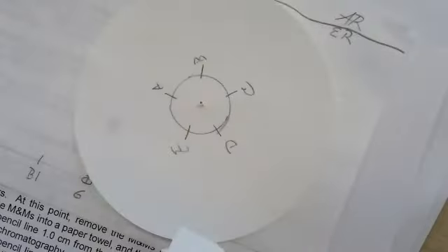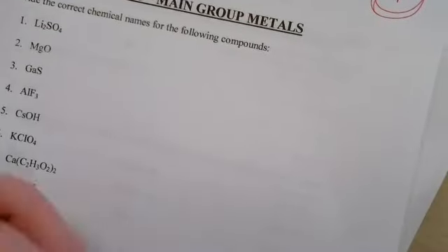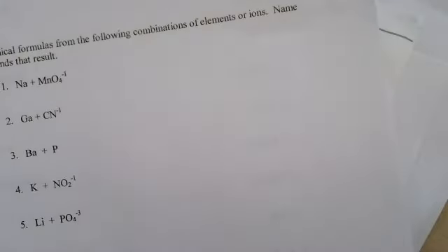Page 4 of your unit packet. Page 4. We take that opportunity to go ahead and practice naming and formula writing. If this isn't completed during our lab work, could you please do that for homework? So page 4. We are working with glassware and an alcohol solution and salt solution, so we definitely need our goggles. I am here to address any concerns that we might have. Go team.